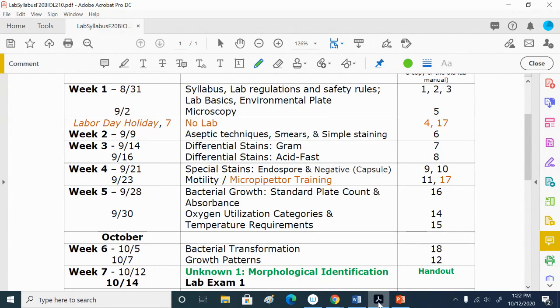Safranin. Safranin, right? So by the time we're finished, what's the color of gram-positive bacteria? Purple. Purple. Yeah, purple, right? So just remember, positive purple, right? PP. And the negative cells are red.